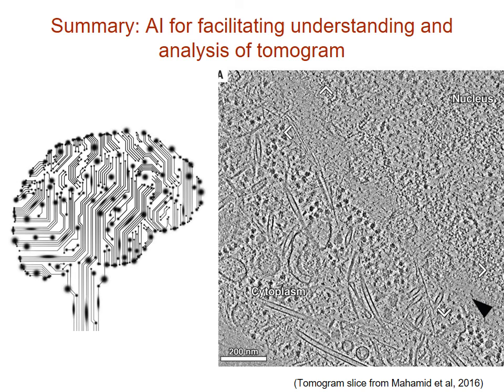In summary, we have been working on developing different computer vision and machine learning methods to facilitate the understanding and analysis of cellular tomograms, which is fundamentally important to understand the basic molecular machinery of cells.